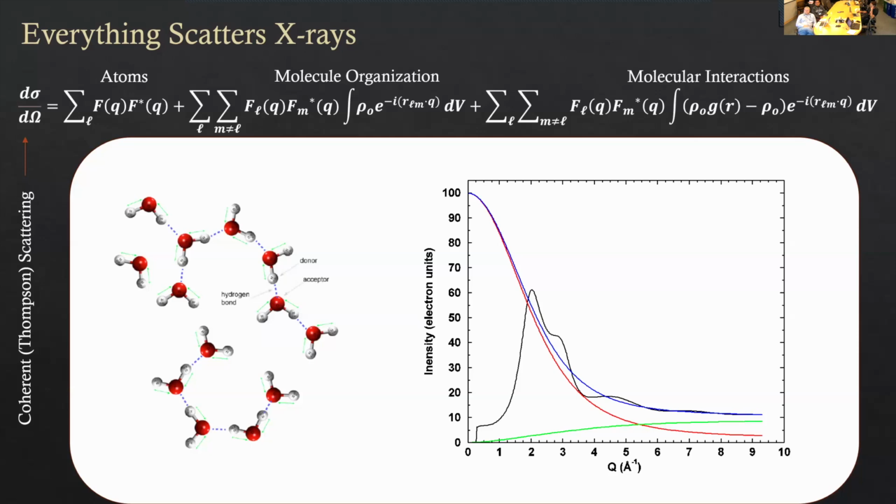And so I've decomposed these little pieces, right? So there's the oxygen here, then the water term is the blue curve, and then what takes over in water is the organization of water molecules relative to one another. This is the black curve, and you can see that there's a huge change between them independently. So gas water would look like this. Water looks like this black curve.